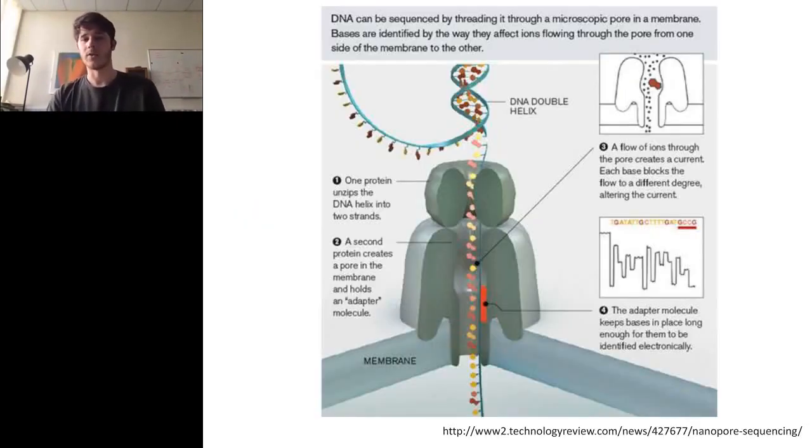So nanopores are biological proteins, and they're ubiquitous in nature. This particular protein is a membrane protein or lipoprotein from E. coli, and pores insert into membranes, and in this case it's an insulating membrane, so that if a voltage is applied to it, then ions have to flow through the middle of the pore.